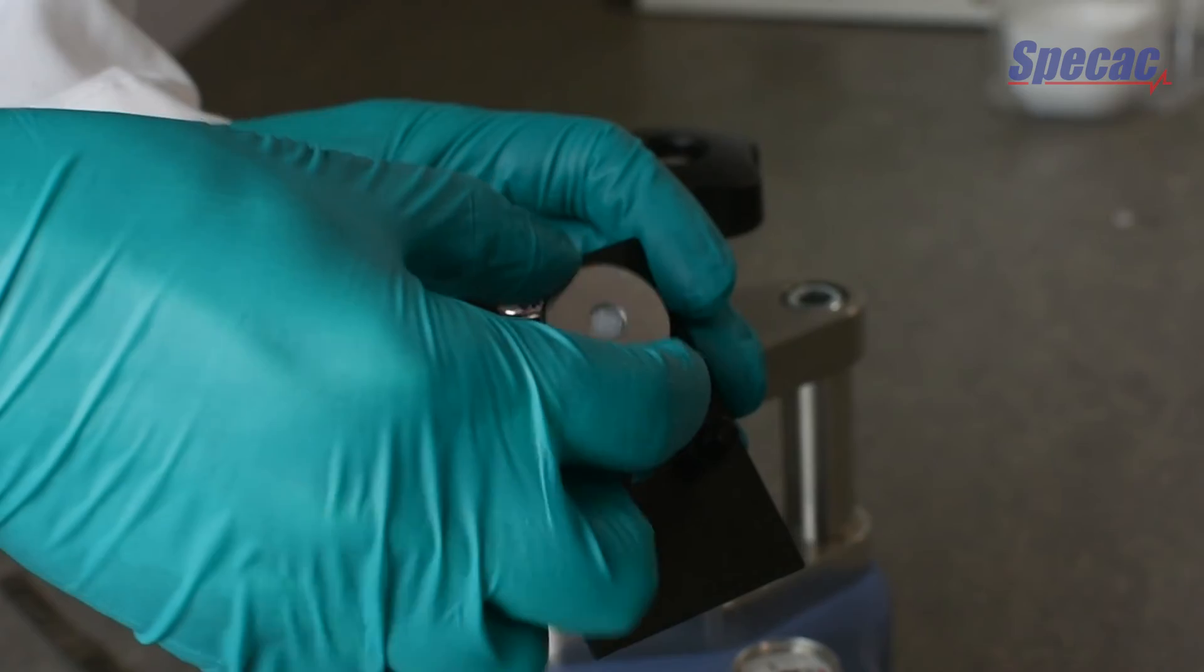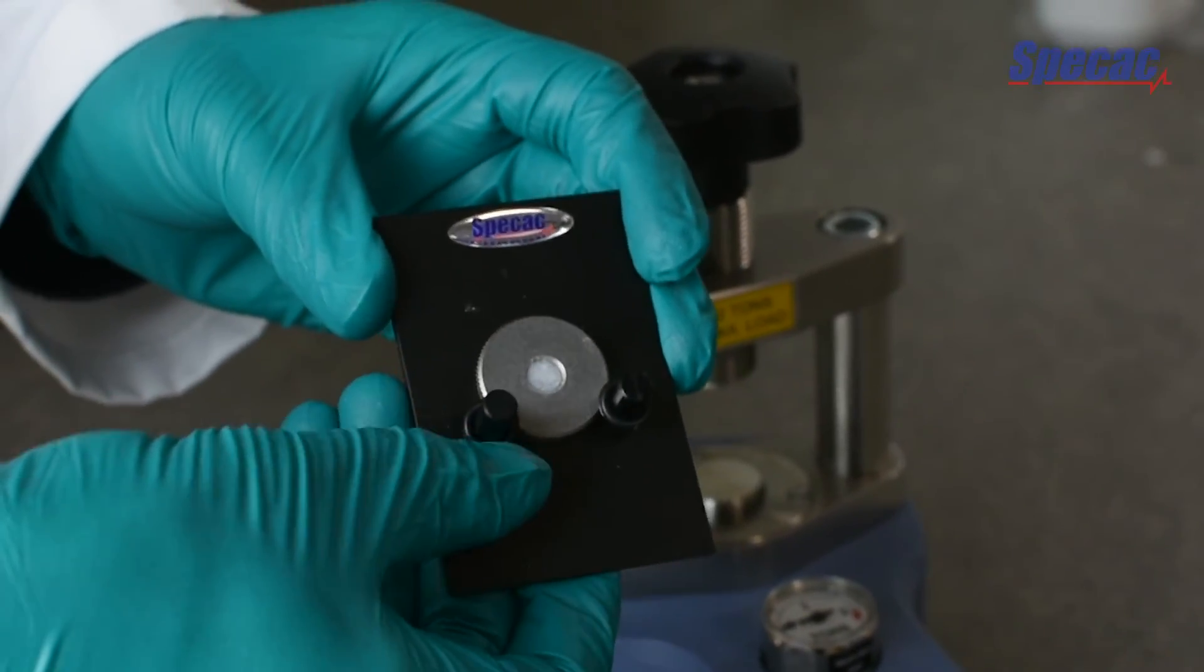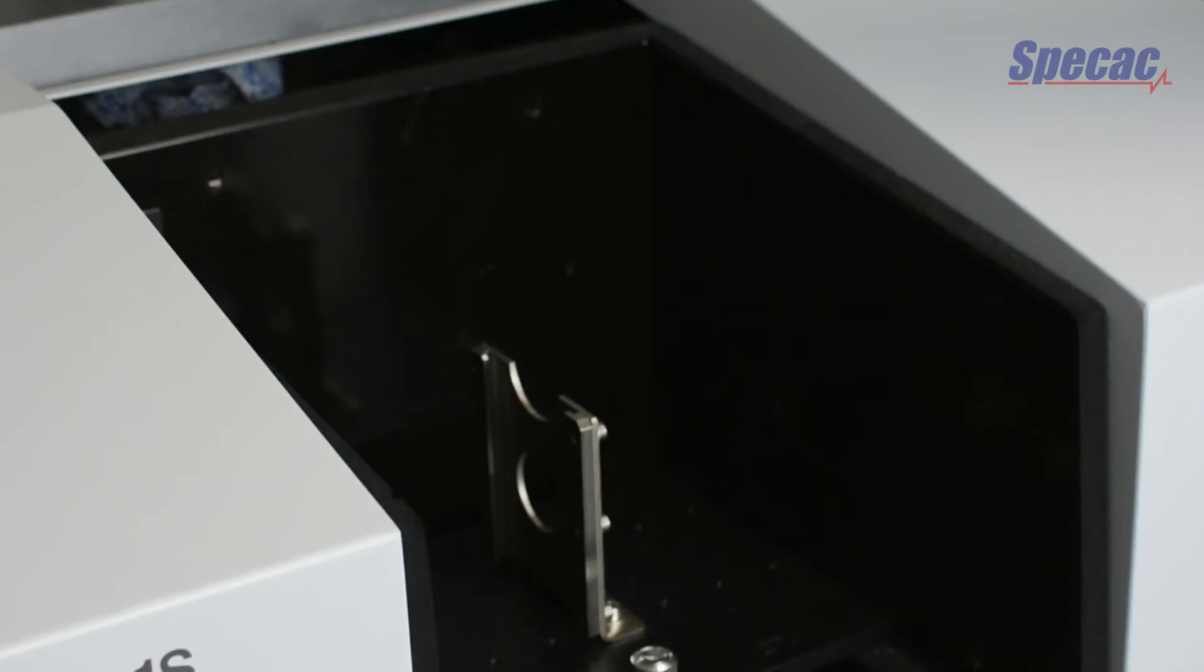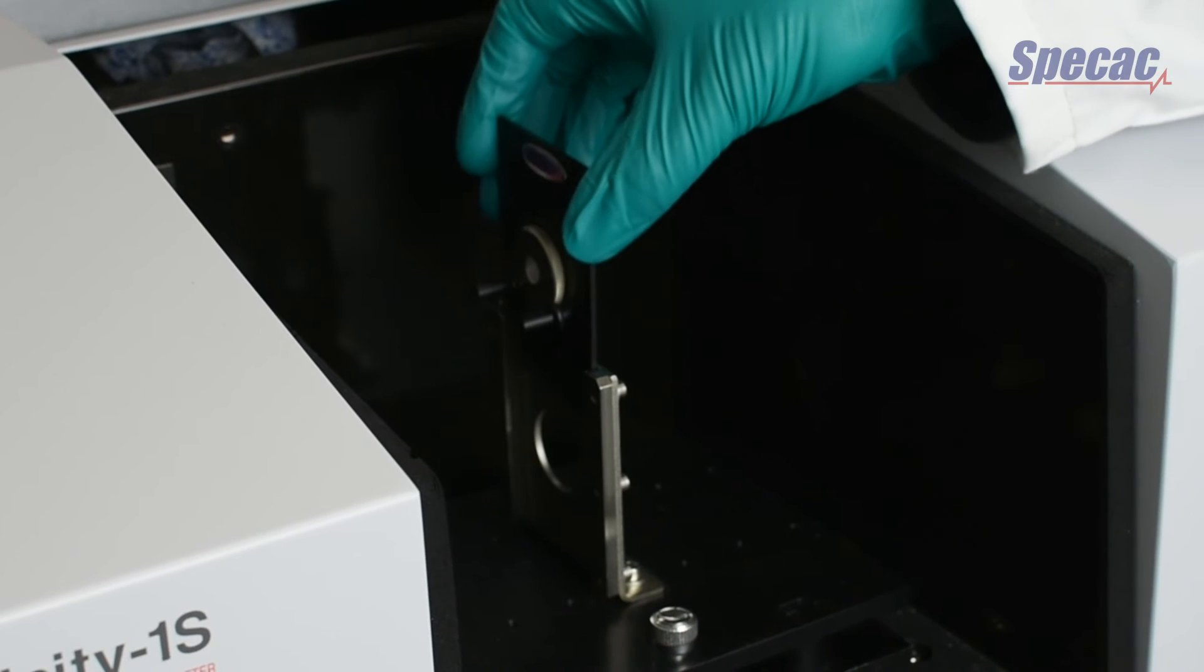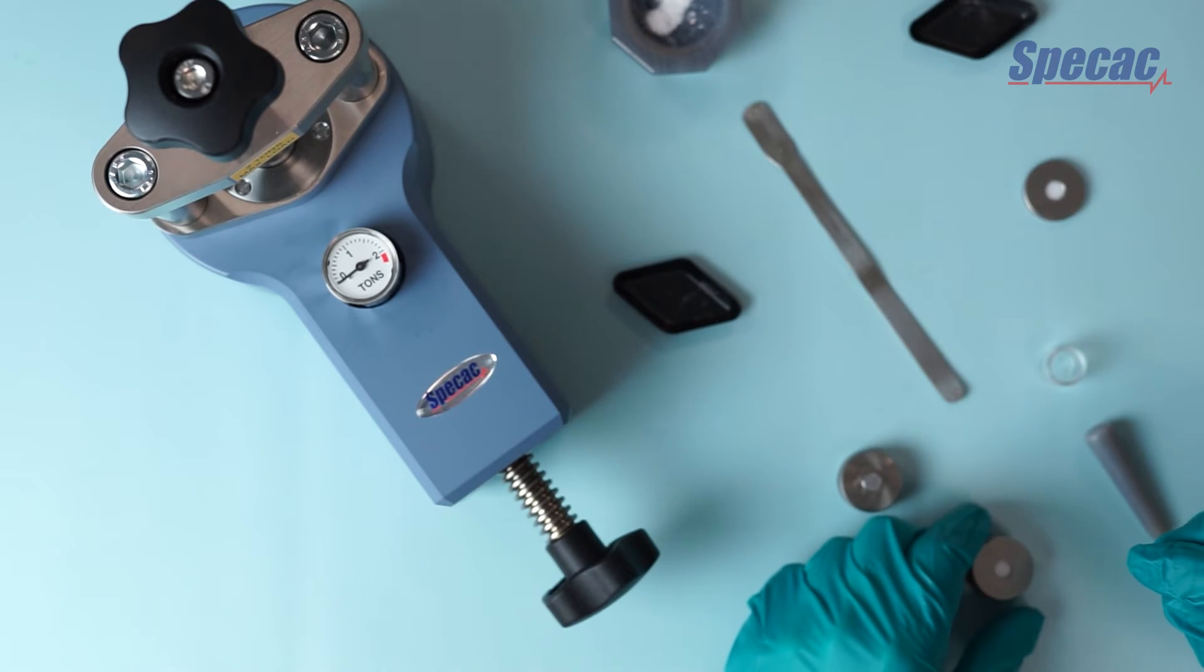We can then add this to the 3x2 slide mount provided with the kit, using these o-rings to just secure it in place. And then transfer it over to our spectrometer and fit it using the slide mount apparatus there.